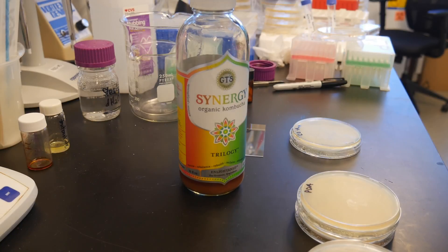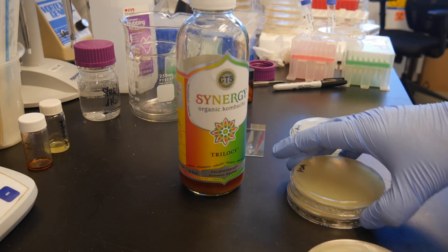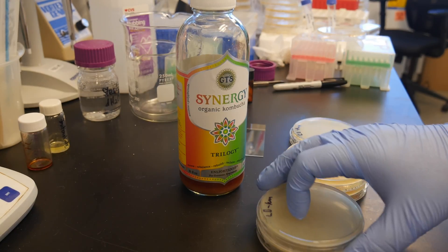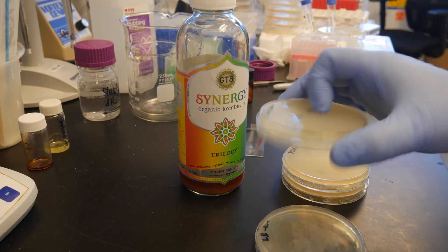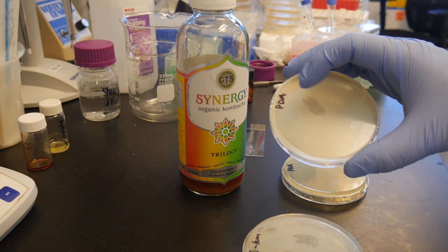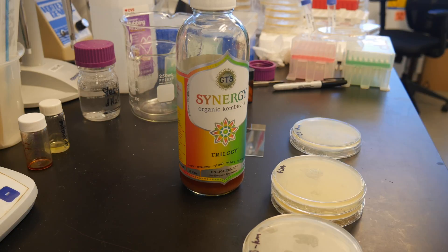All you need to do to see what's inside is take a swab. I have three different kinds of media. One is LB, which is probably going to be good for the Bacillus. One is PDA, potato dextrose agar, which is hopefully going to be better for the fungi, the yeast.